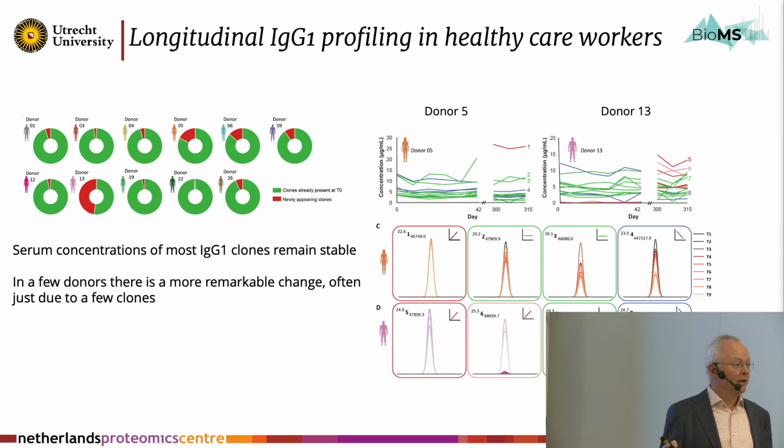So are there more antibodies there? Why don't you see a difference induced by the vaccination? Maybe because the antibodies made upon vaccination are lower abundant than the ones that we detect. Can we work on that?